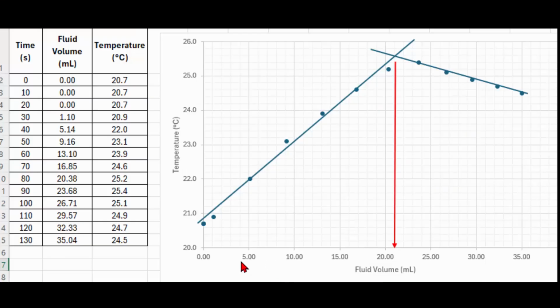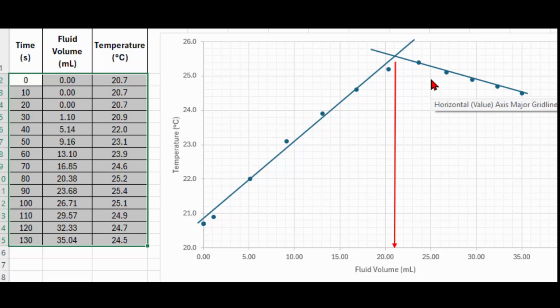And so when I process that data, I end up getting a little confused about whether I should take this line or that line. That one's clearly curving over. And so I've come up with 21. So obviously the correct answer is meant to be 25 because it was 1 molar sodium hydroxide, 1 molar HCl, and 25 was initially in the cup.